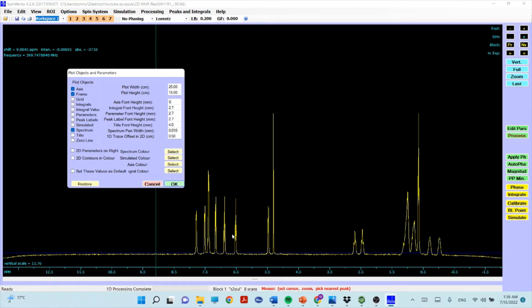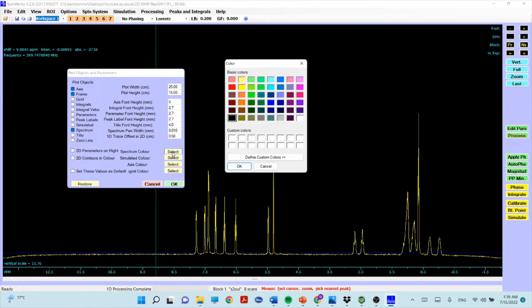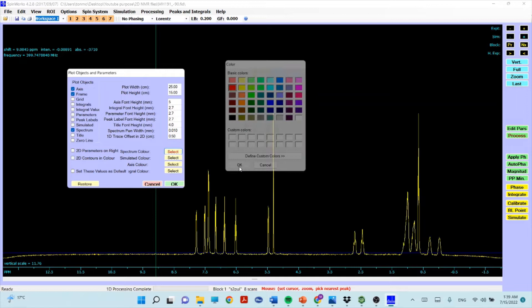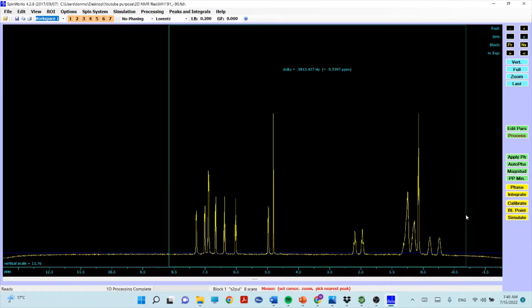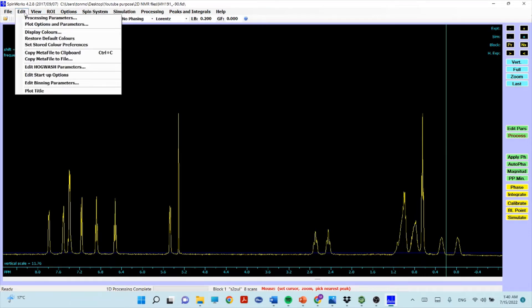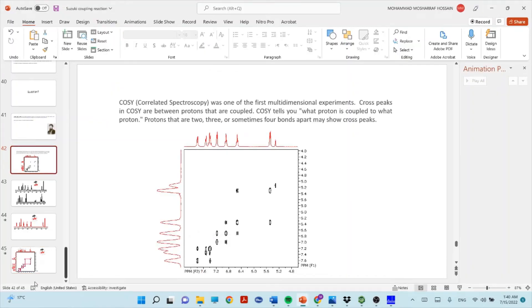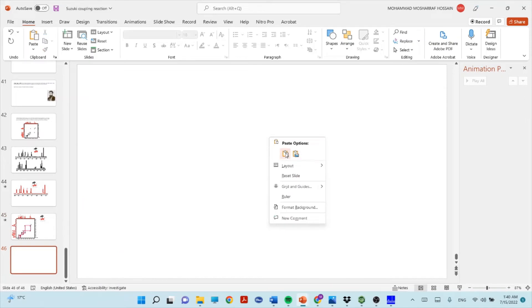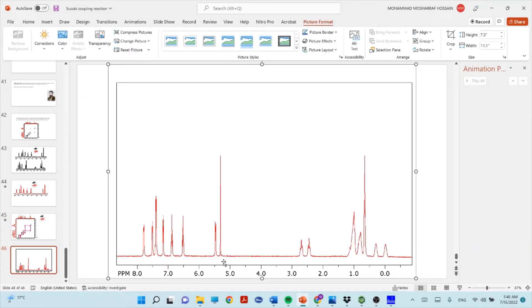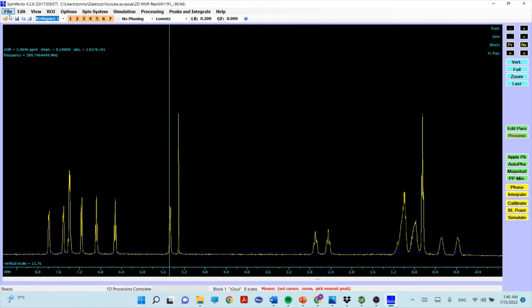If you want the spectrum colored, you can select Color 2D, choose a color such as red, and click OK. To copy the spectrum to a Word or PowerPoint file, click Edit then Copy Meta File to Clipboard, then paste it into your document. You will see the spectrum displayed in the selected color. That covers the 1D processing in SpinWorks.